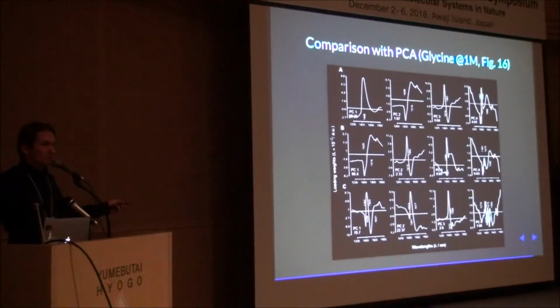What happens in terms of variance distribution? Still, you have 95. Okay, you're getting a little bit better distribution of variance, and still, this is very low. When you finally use the optimized subtraction of pure water using the database, you get a significant decrease. From 98, almost 100, you get to 70. And then your second principal component jumps to 20.